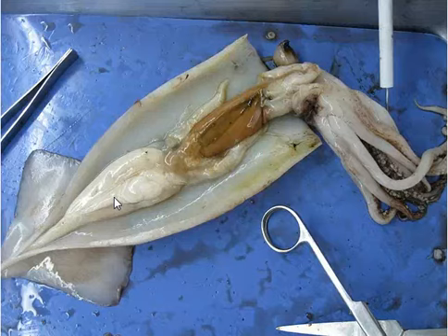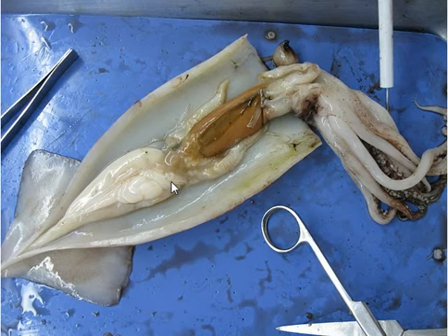Hi, it's really noisy right now, but this is my squid dissection. I did it with a guy called Ronan. This is a four-step process and that's the scalpel and scissors.